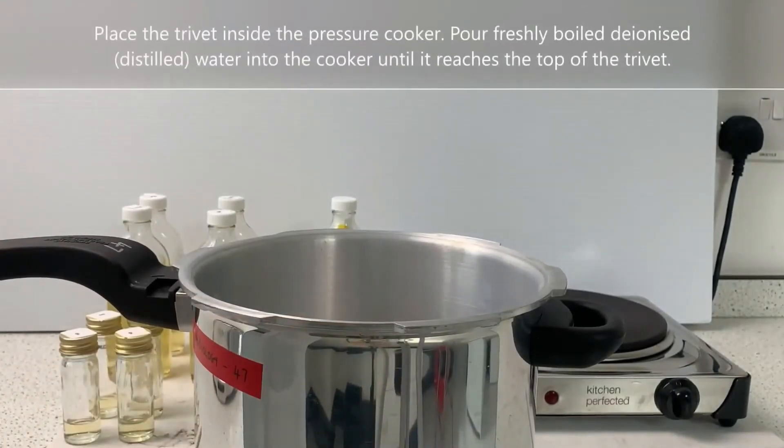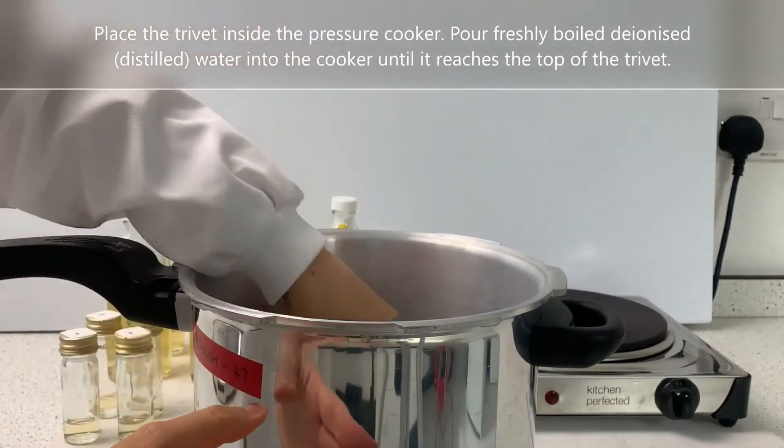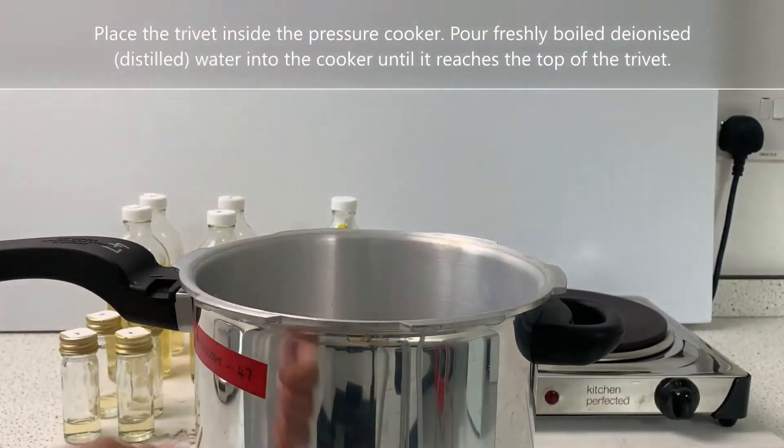Place the trivet inside the pressure cooker. Pour freshly boiled deionised or distilled water into the cooker until it reaches the top of the trivet.